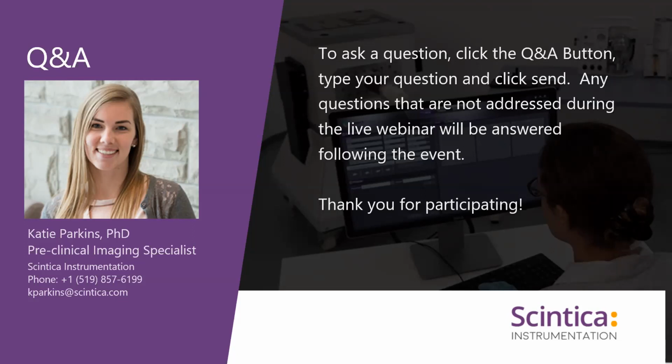So basically you take the heart out of the tissue and then flash freeze it or put it in the stain, and then you can image it. But the system cannot image the beating heart because the frame rate is slower compared to the rodent heart beating rate. Lungs can be imaged depending upon which part of the lung you are looking at. If you are looking right in the middle of the lung where the motion artifact is going to be really high, then it's going to be difficult. But if you are looking at the tip, then it's really interesting.